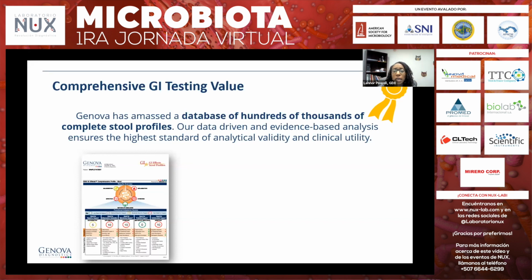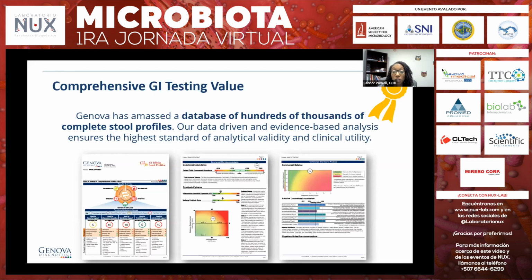And so here you'll see page 2 and 3 of the report, and you'll see that it's divided into the abundance, the dysbiosis, and the balance parts. And that again is really driven based on the database of the complete profiles that we have along with questionnaires.